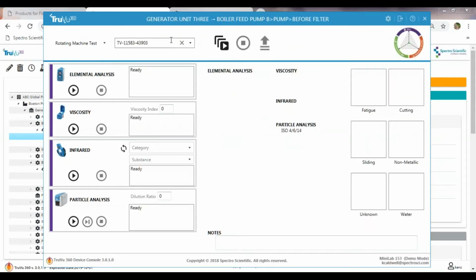Okay, so I have my sample here. I'm going to run all. You'll see this run measurements. This pushes the information to all the instruments. These instruments I'm showing here consist of these 4 pieces of instrumentation. This makes up what we call the Minilab 153. It's the core product offer, I should say, for our industrial plants. So it's our industrial offer.